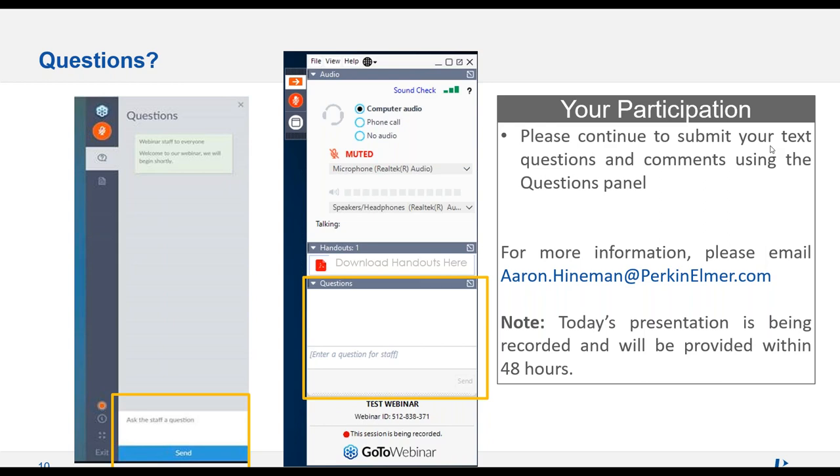So to answer that question on the NexION 300, do a mass cal using lithium and see if you can see 6 and 7. If you can at 1 ppb, then the answer is yes. Yeah, I suspect they would. And if you can't see it, then the answer is no.